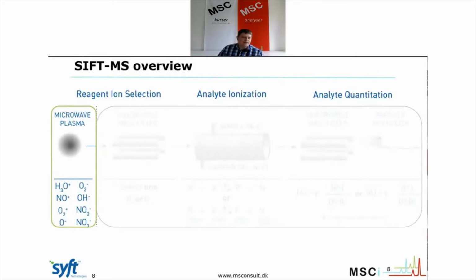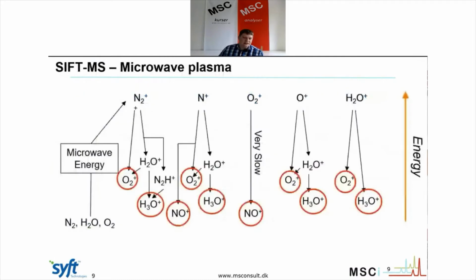So we'll look a bit more in depth at the different parts of the instrument. First off, we have the microwave plasma. Essentially, you pump in atmospheric air at the right pressures, and then you bombard it with microwave energy.